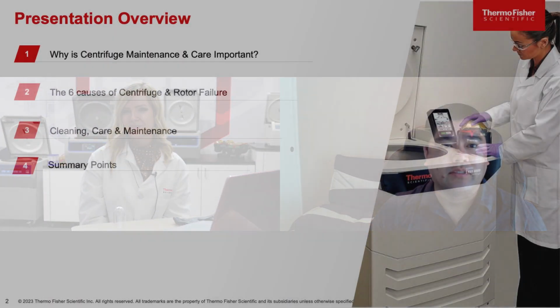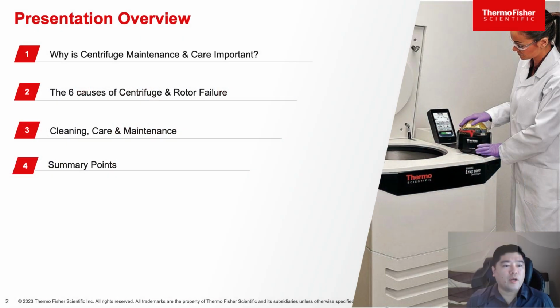All right, thank you, Megan. Good morning, everyone. Today we'll talk about centrifugation safety best practices. We'll start off by going over why centrifugation maintenance and care is important. We'll then follow that up by diving into the 6 common causes of centrifuge and rotor failure. Then we'll go over specific cleaning, care, and maintenance recommendations. And then finally, we'll do a quick summary of what was presented.